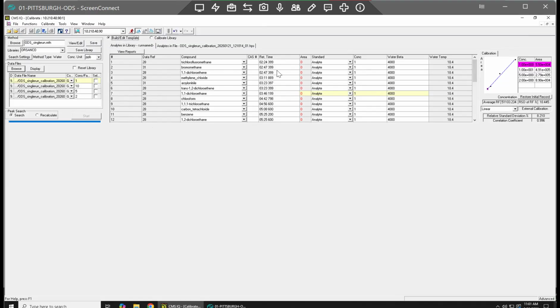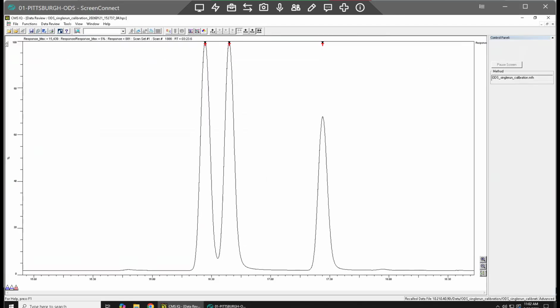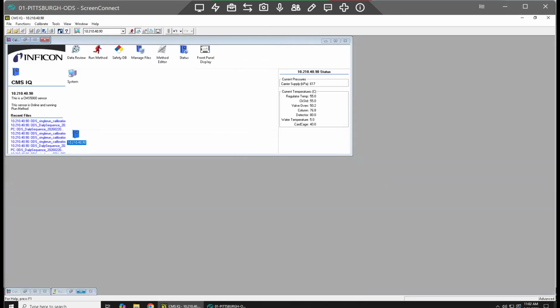And what that does is it does let me edit everything in the file. So what I would do first is I'm going to pull up, probably you want one of your larger concentrations as your reference for your retention time. So I'm going to use my level 10. If you click it and hit display, it will pull up the chromatogram. Whoop, let's make that a little smaller here. And I just want it side by side here. So where'd it go?